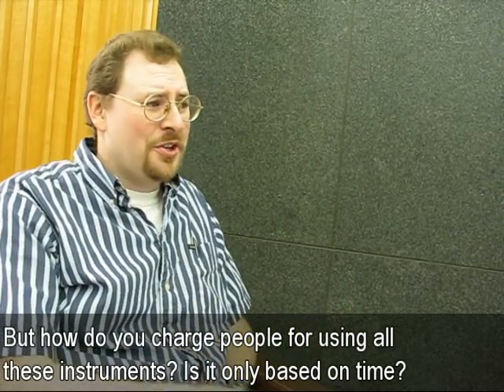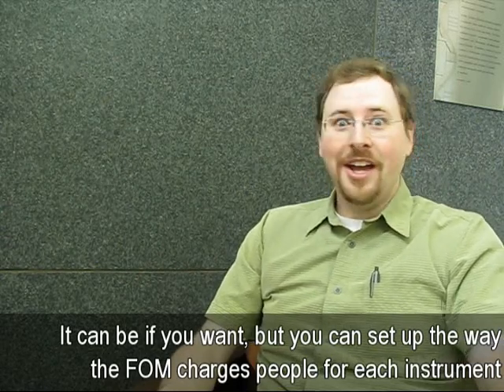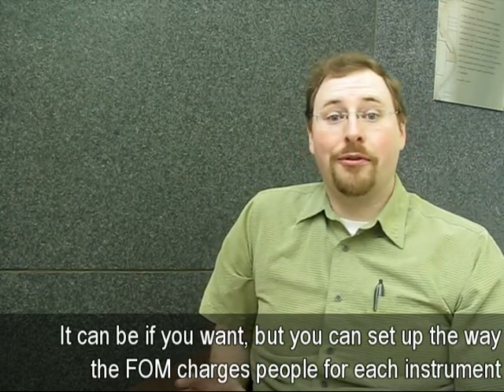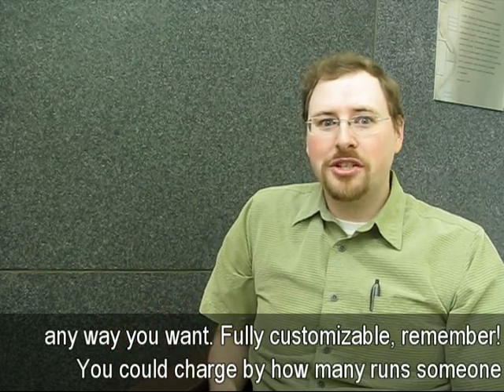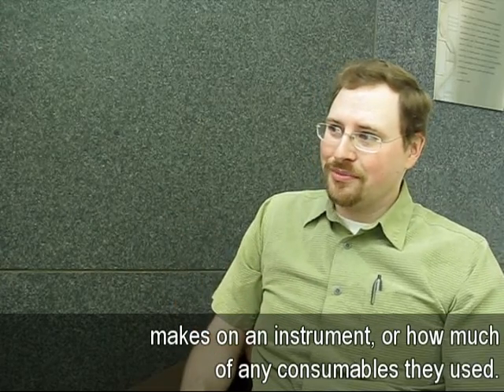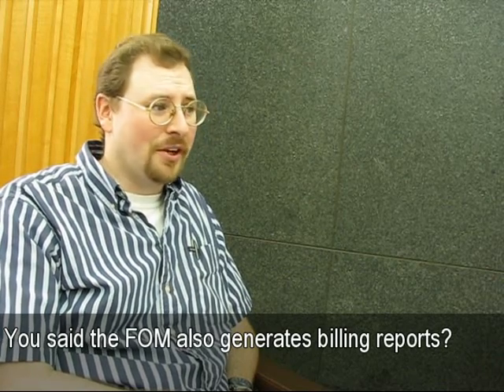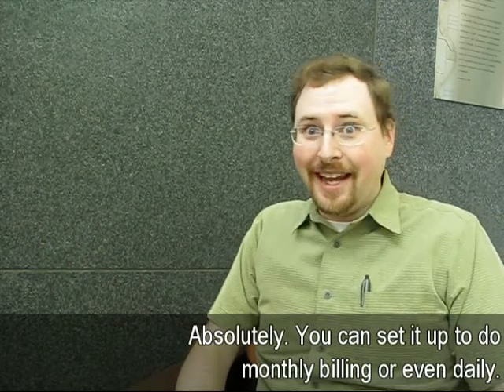But how do you charge people for using all these instruments? Is it only based on time? It can be if you want, but you can set up the way FOM charges people for each instrument any way you want. Fully customizable, remember? You could charge by how many runs someone makes on an instrument, or how much of any consumables they used. You said the FOM also generates billing reports. Absolutely, you can set it up to do monthly billing or even daily.